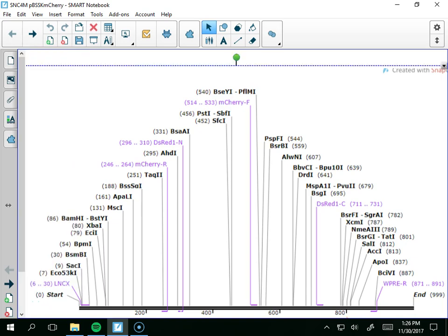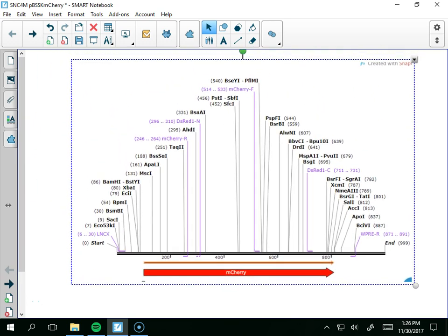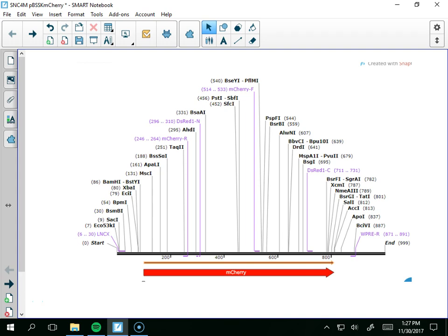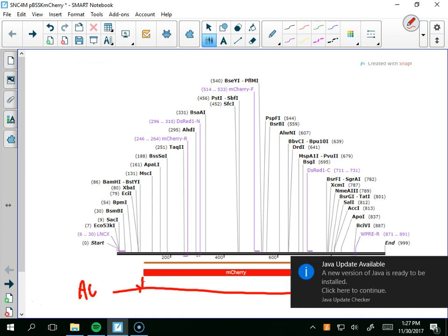All right, so we are looking at the gene, or the map, for a fluorescent protein called mCherry. What you'll often see with genes, or what are called cDNAs, is that the actual gene that gets expressed will be here. So this part will be which codon? What codon would we see there? Remember codons from a few weeks ago? Fuzzy? Not so much? Okay, we'll probably review that. A, U, and G.